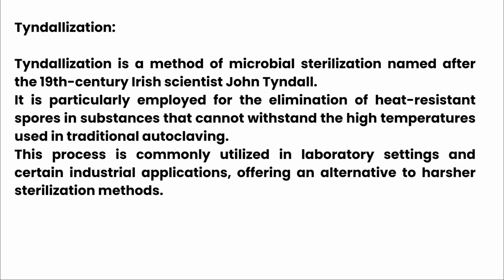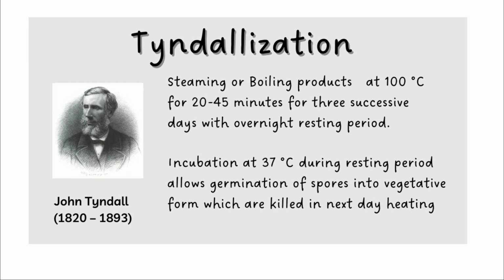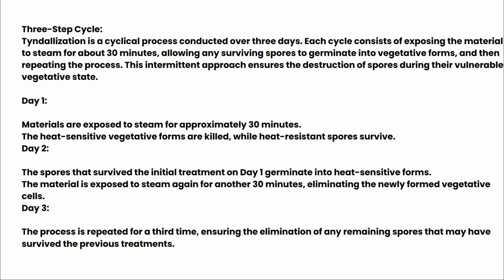Tyndallization. Tyndallization is a method of microbial sterilization which is named after the Irish scientist John Tyndall. Here I will show you the protocol or the procedure.